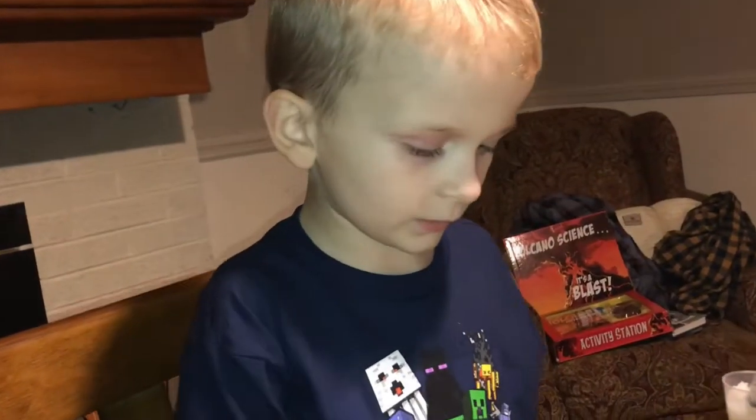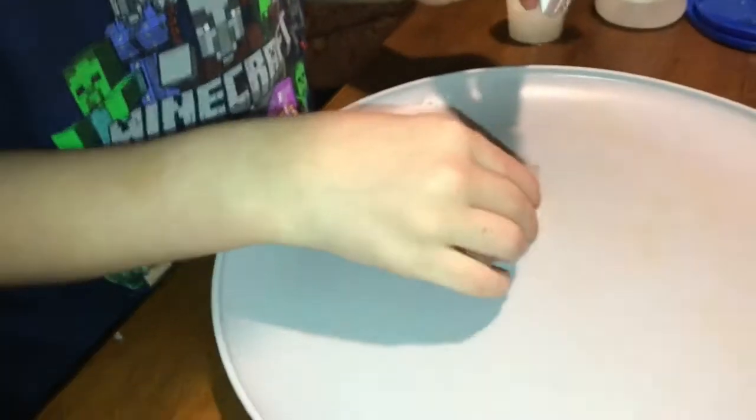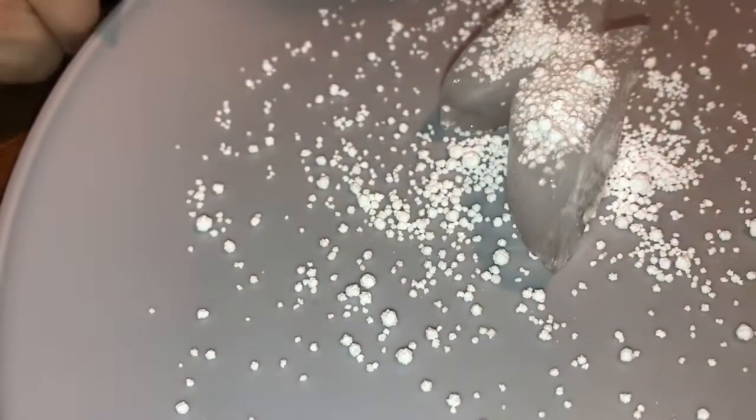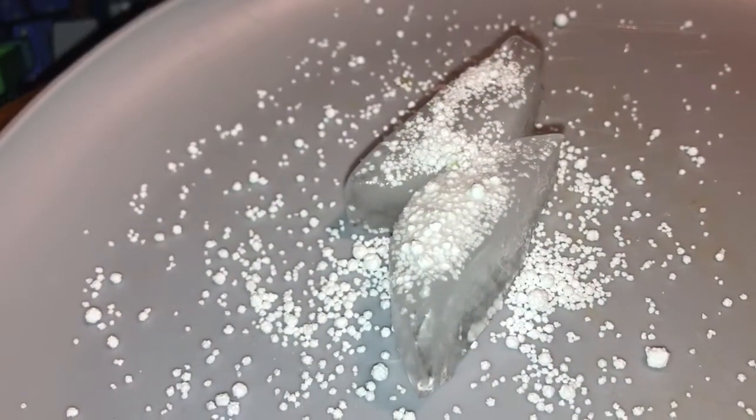Now the next one is pretty easy. You get two pieces of ice and pour some crossy cool ice on it. Put it on! That's weird. What's happening? They're moving! They're moving! Look, they're moving! Some of them are gone. Awesome!